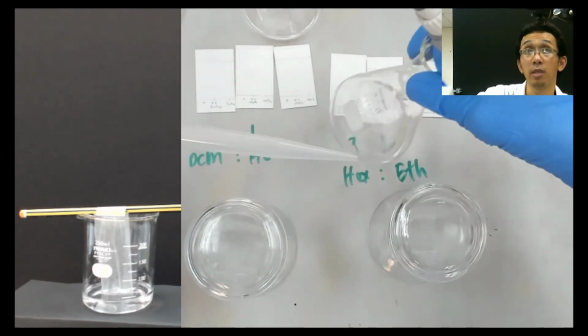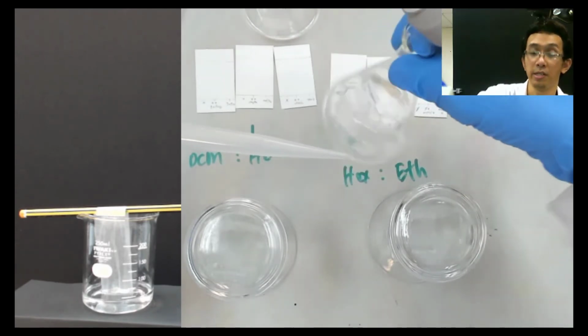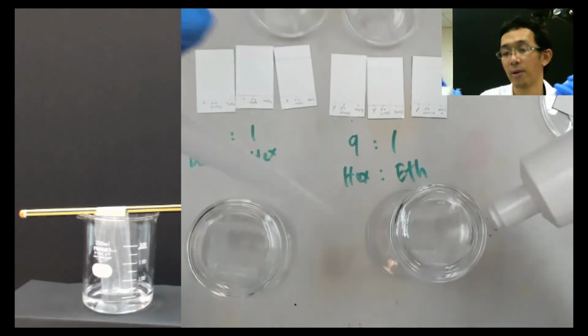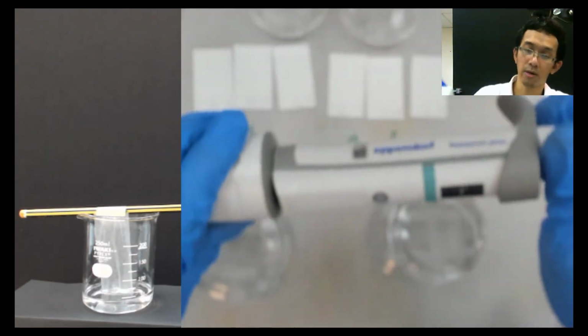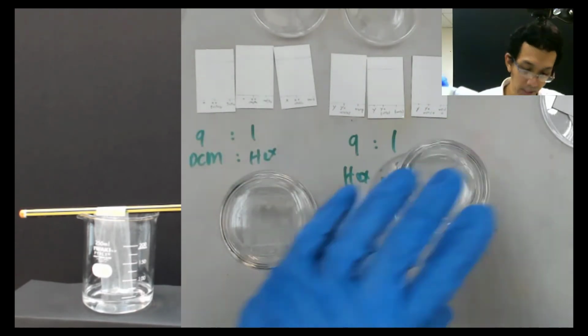Previously, we were putting different solvents separately, but now it's a combination. It's a different thing. So that's what you need to be aware of when you do things in your lab. You need to be careful. Everything that you do must have a reason. If not, then you can mess with the result.